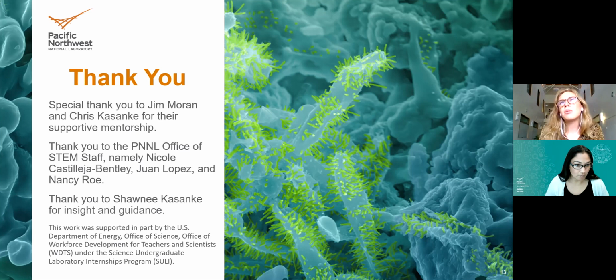I would say perhaps our most recent one was finding out that using non-molecular grade salt in our buffers actually caused enough degradation in the columns of our HPLC that we had no products by the time it actually hit our column and ran on the instrument. So little things like that, just tweaks bit by bit in the process, and moving forward, hopefully things will be smoother sailing. Awesome, thanks, and great presentation.